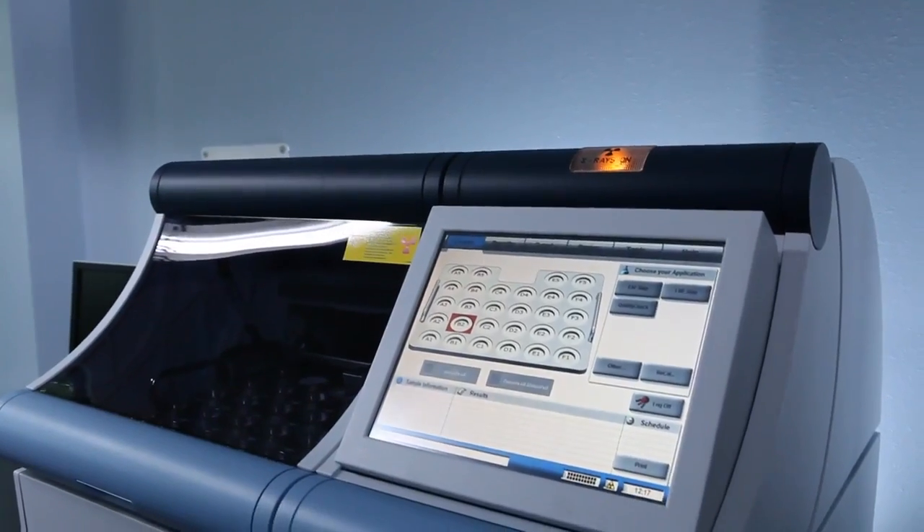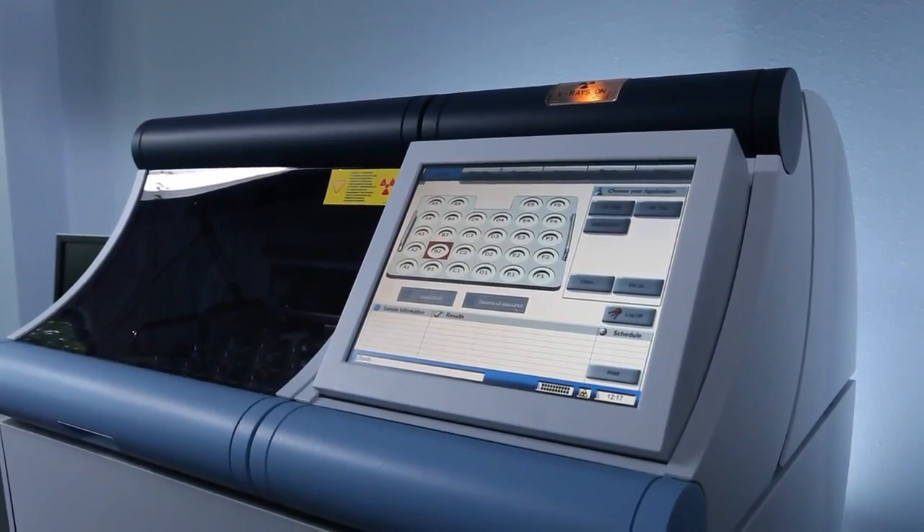The S2 Ranger, as an energy dispersive XRF technique, offers many advantages. It's low cost — low cost of ownership, low cost of maintenance, low cost of running. Because there are so few moving parts in the instrumentation, there's very little maintenance required.